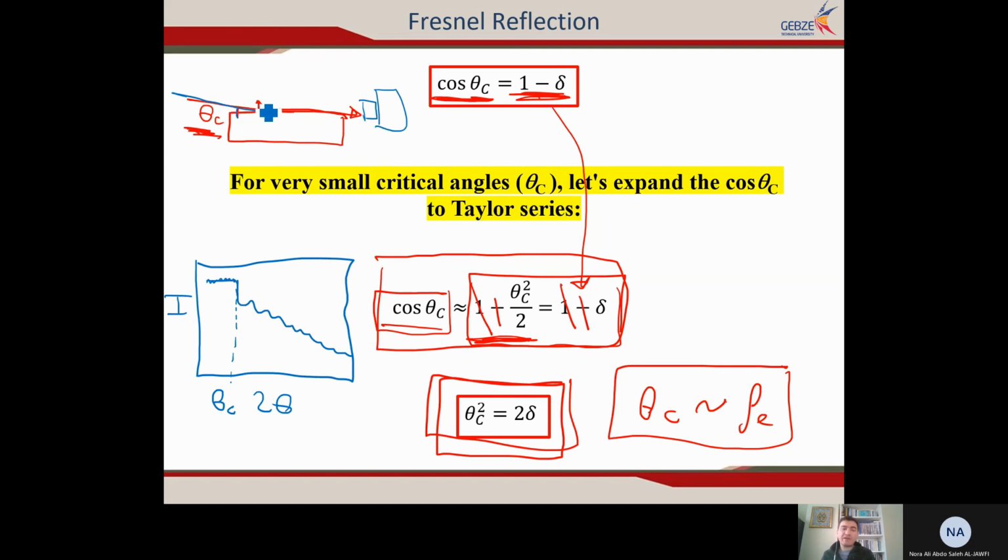But if the incident angle is bigger than the critical angle, then the incoming X-rays start to penetrate into the material, and then we have transmission. Some part of the incoming X-rays are lost within the material. Fewer photons go to the detector in that condition, so the intensity at the detector decreases at this angle.